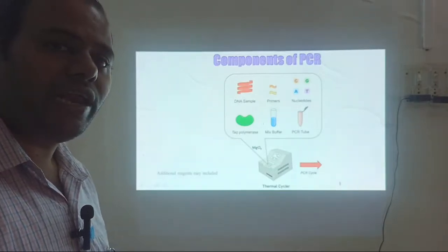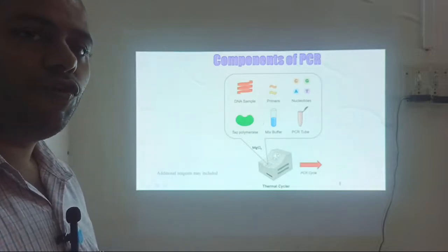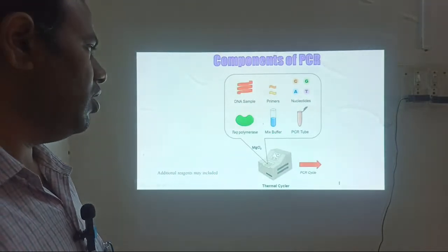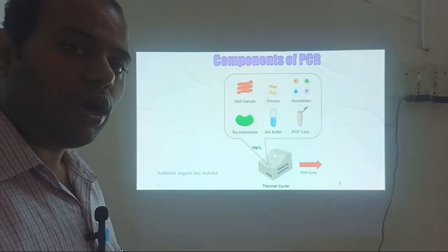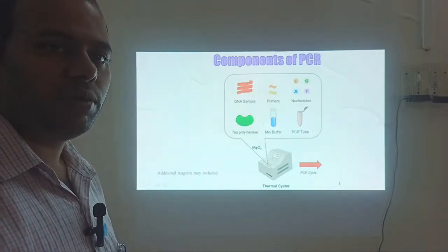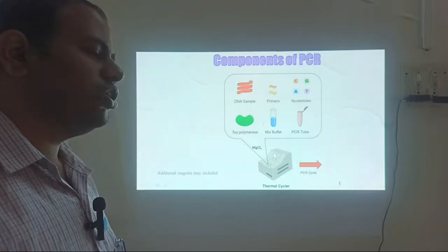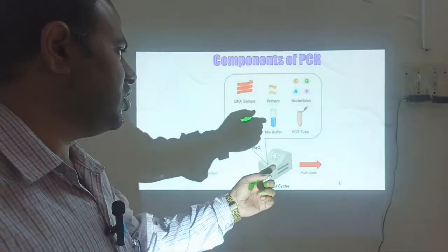If you are using a regular enzyme, what is going to happen? The enzyme is going to denature. Therefore, the thermostable enzyme Taq DNA polymerase is used. There is a problem with this DNA polymerase: it polymerizes at a very high rate, but it does not have proofreading activity. So sometimes we mix it with other thermostable polymerases, such as Pfu polymerase, which also does the proofreading.